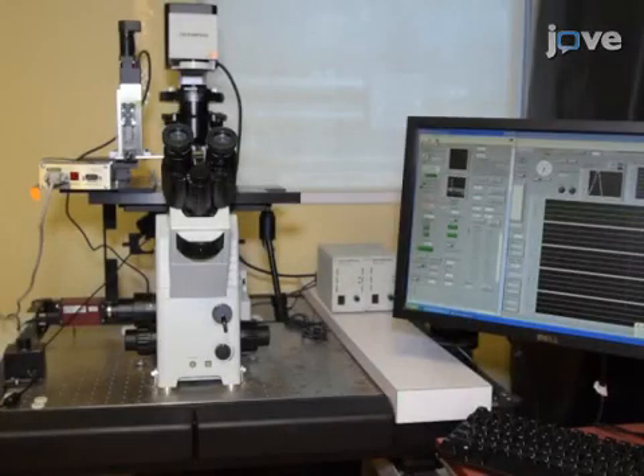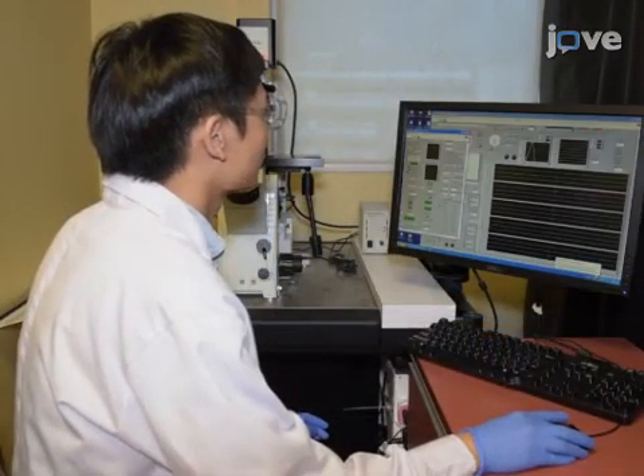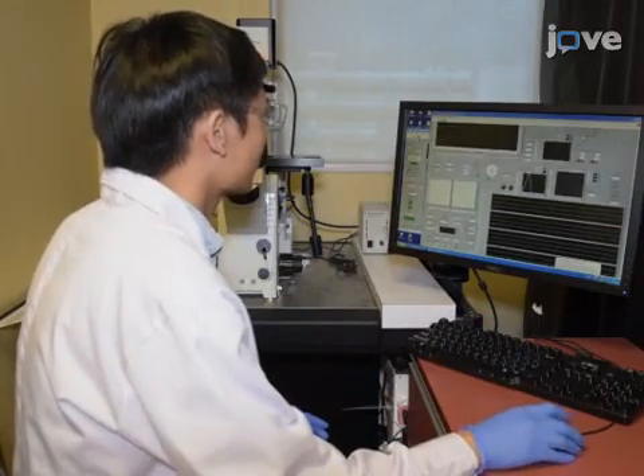For the magnetic tweezers setup, start the magnetic tweezers control program. The magnetic tweezers are controlled by an in-house written LabVIEW program.